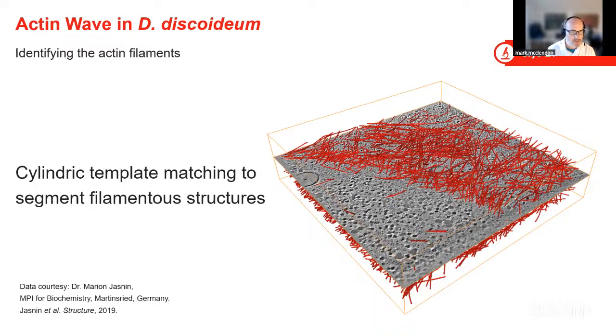Now, this is something that's meant for multiple different fibers being in your data structure. So if you just have one big fiber or one big cylinder... Oh, it's just one big cylinder. Yeah. Oh, okay. Then in that case, I don't think you would want to be using something like the cylinder correlation. You're just trying to segment that entire fiber, right? That singular one? Yeah, there are two layers to it, and I'm just trying to segment the outer layer of it. Ah, okay.